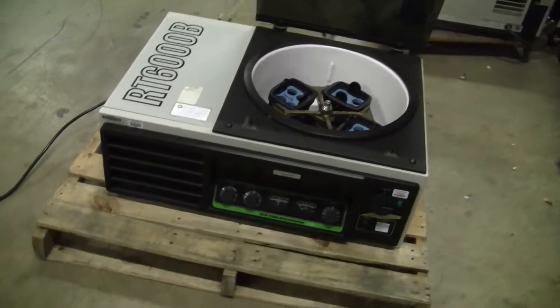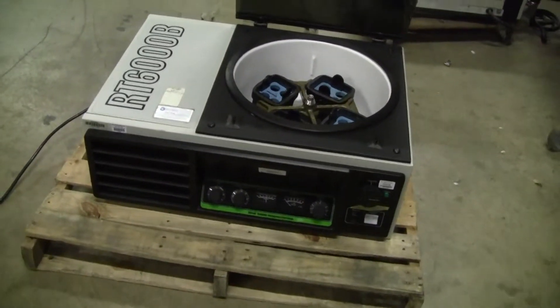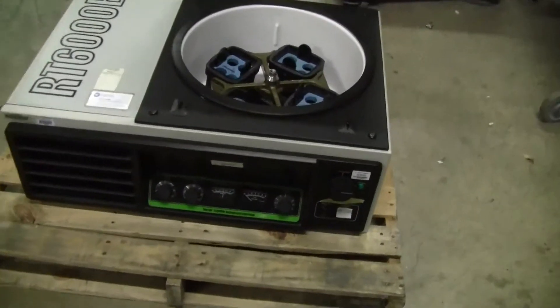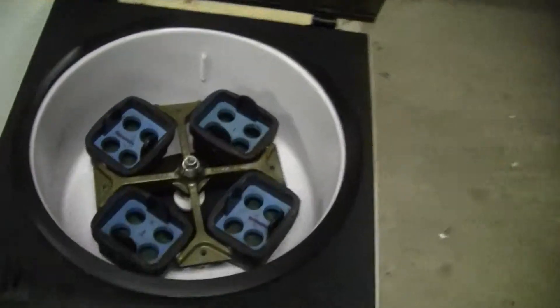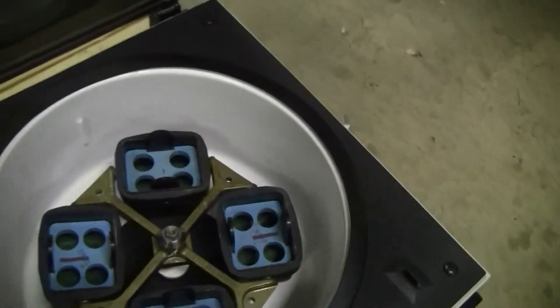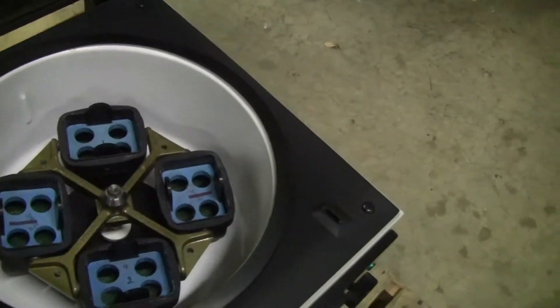Hi, this is Jim from HitechTrader. We're looking at the RT-6000B Refrigerated Centrifuge, Sorval RT-6000B. It currently has a four-bucket rotor right there — it's a Sorval H-1000B. The buckets currently hold 50 milliliter tubes.